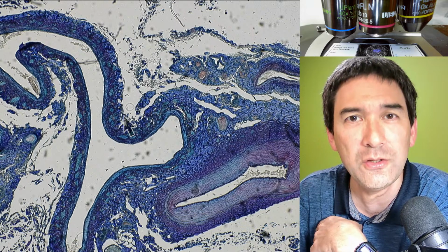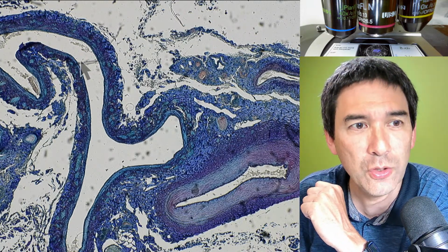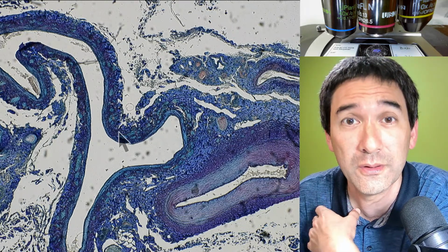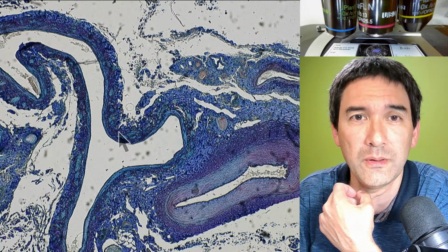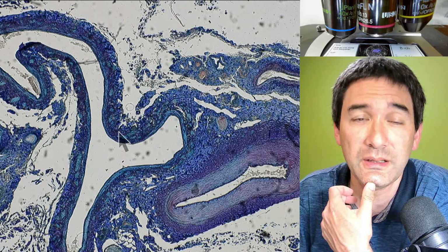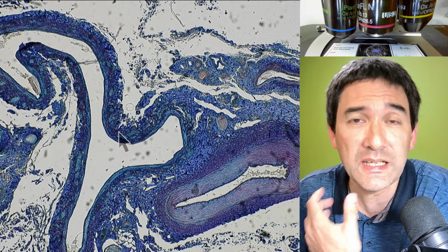It could be that in your microscope, because you have a smaller camera sensor, you're only able to see a smaller region from the center, but magnified more. So this is the problem of comparing magnifications, because if I say I'm using a 4 times objective right now, it does not mean that you're able to see it the same way. And this basically makes it very difficult.